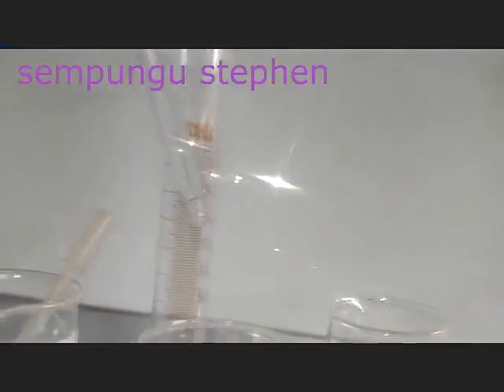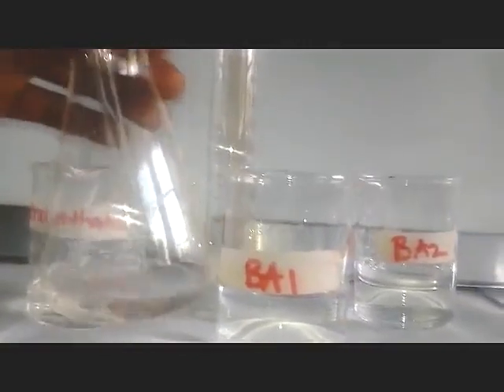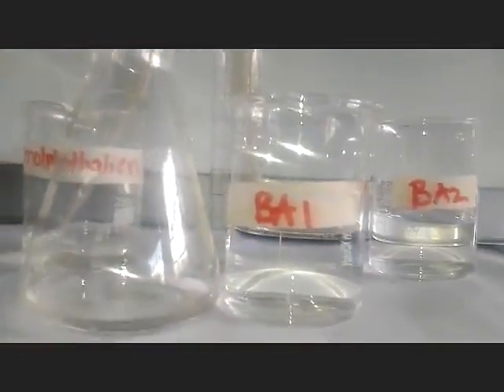After doing that, the man has told us to transfer our liquid into a clean conical flask. So I transfer into my conical flask here. I put my liquid. I can even blow air to remove all the liquid from my pipette. That is the meaning of pipetting.